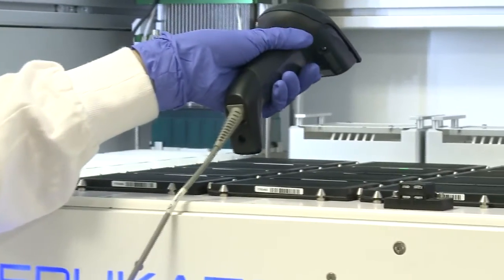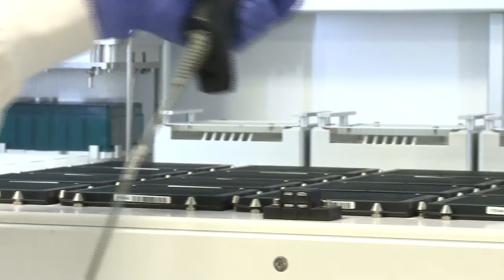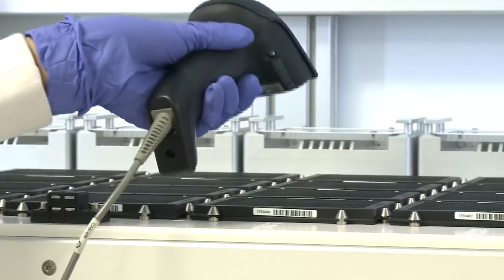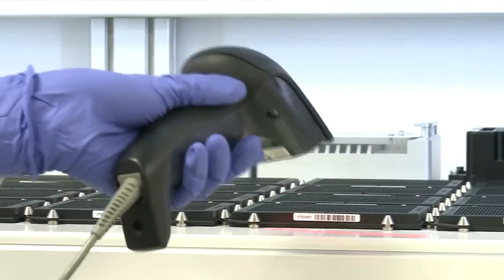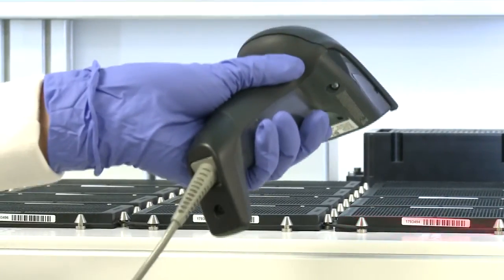So how does it work? Have your plates replicated in any format you like, with a volume maximum of 40 microliters down to 1.5 microliters — the possibilities are endless. Place the plates you wish to replicate, let Replicator know how many, where they are, which volume you'd like transferred, and that's it. Replicator does the rest.